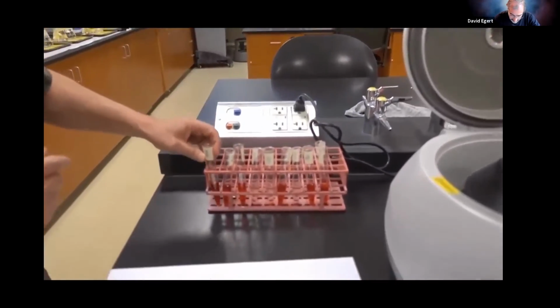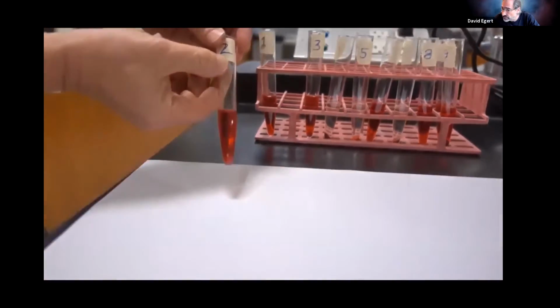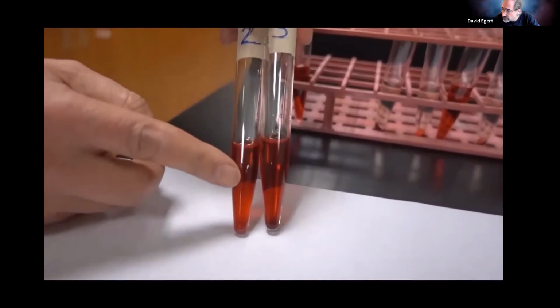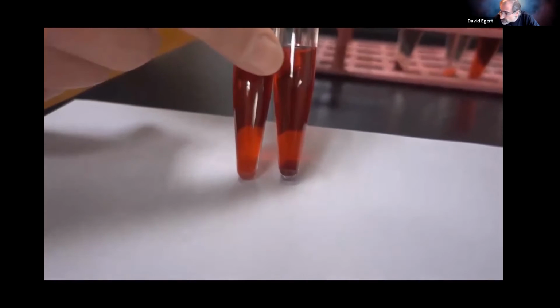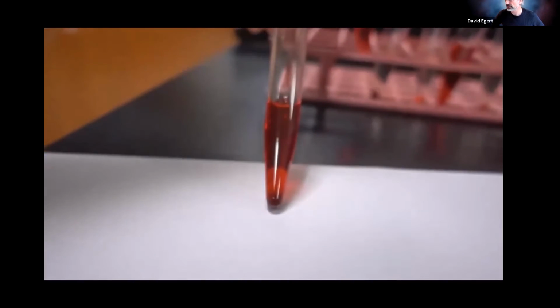And again, we have varying hypotonic solutions. And one of the things that's interesting is we go to the 0.1 osmolar, 0.2 osmolar. And the 0.2, even though these are both hypotonic, we have red, which tells us we had lysis going on, hemolysis. Notice the pellets are actually different. Here, not all the cells necessarily popped. This test tube 3, this one with 0.2 osmolar, was 0.1 molar NaCl.